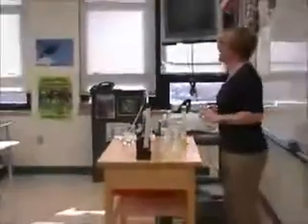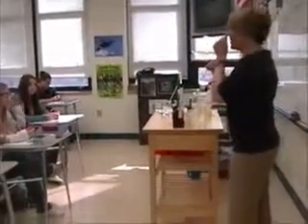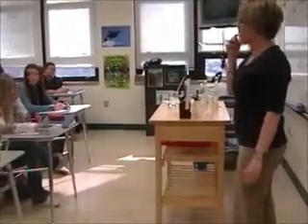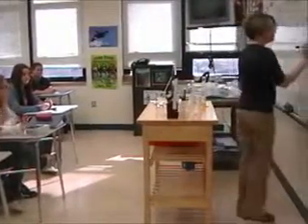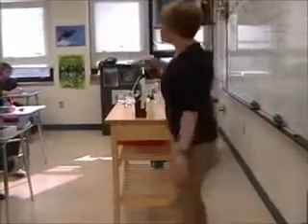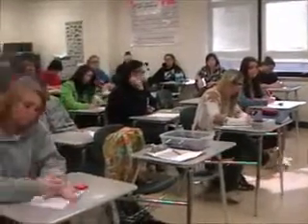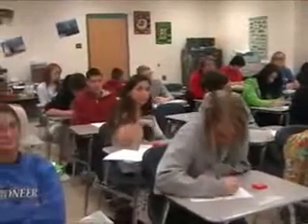So what did we see? What was it? 3.5? 3.7? Did you really get 7? No. What did you get? 4? 3.5? 4? Okay. So let's go with 3.75. Sounds like that would be a good average there. So it looks like your prediction, Sarah, was spot on. That when we doubled our concentration, the reaction time was about cut in half.